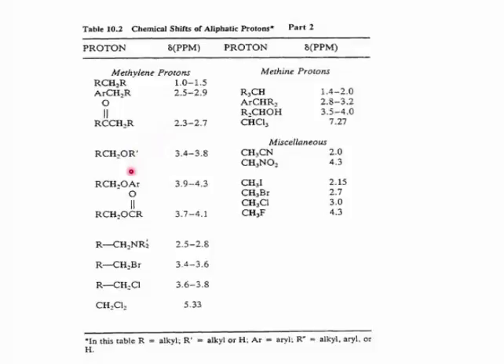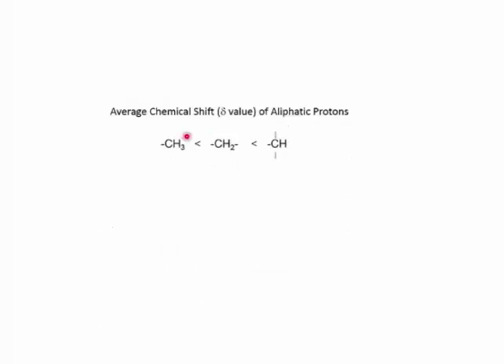And we look, and it's not there. We can't find that exactly, so we'll estimate. We do have a methylene attached to a ketone carbonyl group. That's as close as we can come, and since we're just doing estimates and not going to get exact agreement, we'll use the values here as an estimate. The average between 2.3 and 2.7 is 2.5. So the effect of the carbonyl group on the methylene will estimate a chemical shift of 2.5. Now we've got those two estimates, 2.7 and 2.5.